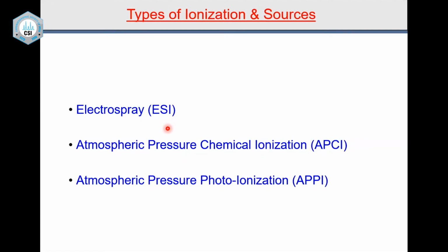But there are some compounds which say, no, we are not amenable to electrospray, we won't ionize under those conditions, we need something a little more stringent, a little more beating in order to ionize. So we will beat up that ion and make sure that it is ionized. So that is atmospheric pressure chemical ionization. And still there are some molecules that say we are not amenable to this either, we need something else, and that is atmospheric photoionization. So different techniques are available to us.